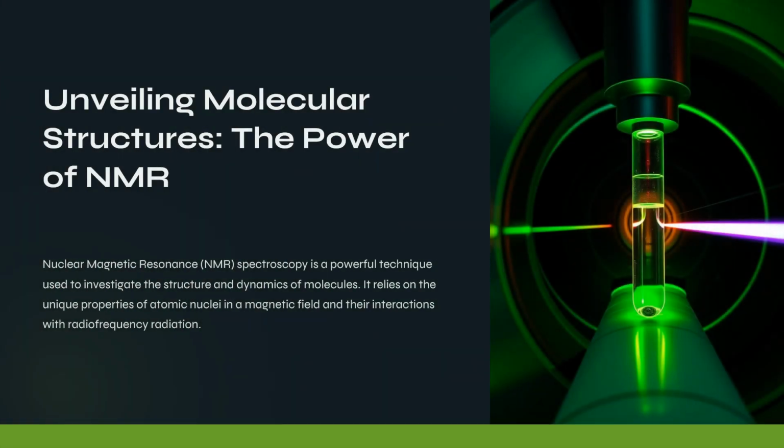Hello, everyone. Today, we are going to explore an exciting scientific technique, nuclear magnetic resonance, or NMR spectroscopy. NMR is a powerful tool used to investigate the structure and dynamics of molecules. It works by examining the unique properties of atomic nuclei when placed in a magnetic field and interacting with radiofrequency radiation. This interaction provides us with detailed information about the arrangement and behavior of atoms within a molecule.